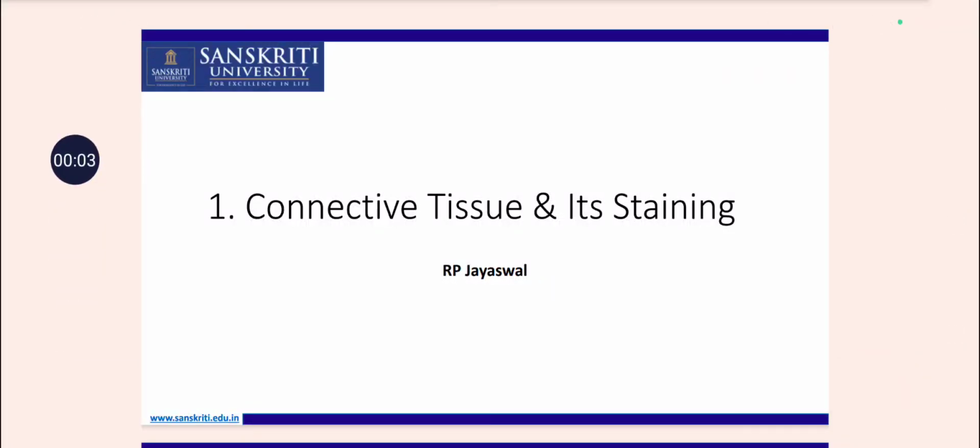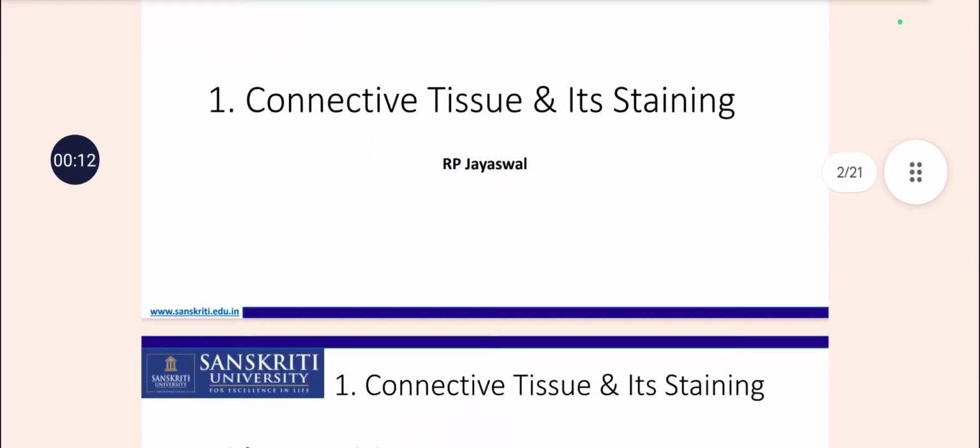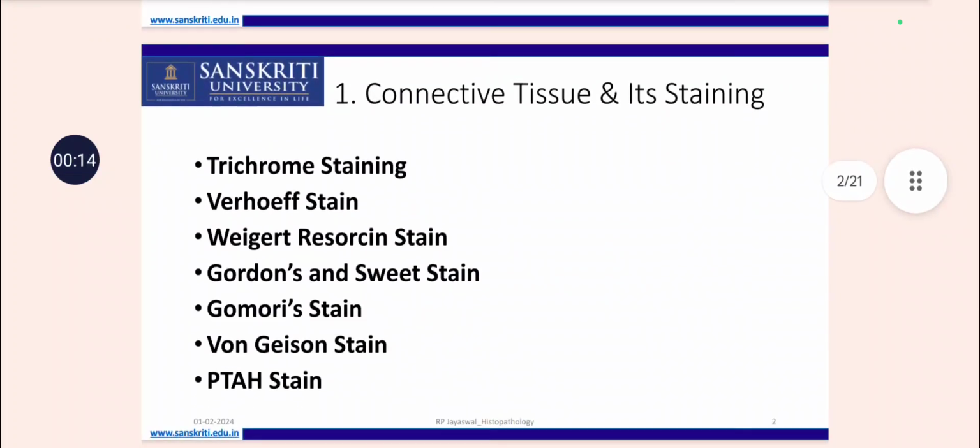Hello everyone. Today we are going to discuss connective tissue and its staining. We'll start with the various methods used for studying connective tissue through histopathological procedures. Following are the staining methods used in the histopathology lab so that we can study the various connective tissues.